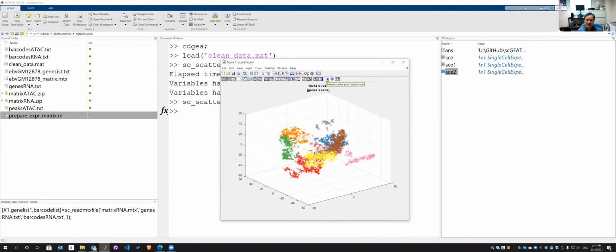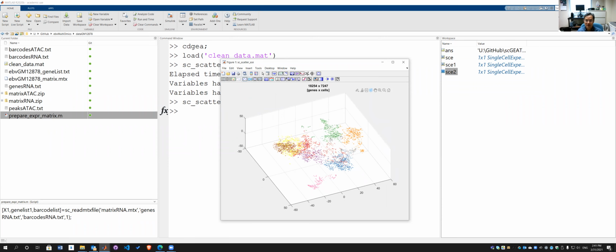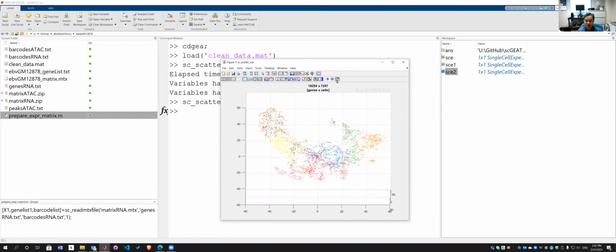Next, after the color maps, you have a switch for different marker types. The reason I gave you these options is that sometimes you have many more cells. You don't want to use this circle to represent each individual cell. You want to use just a single dot. This option allows you to see denser cells. If you have more than 10,000 cells, you may want to use this option to visualize it instead of representing each cell as a circle.